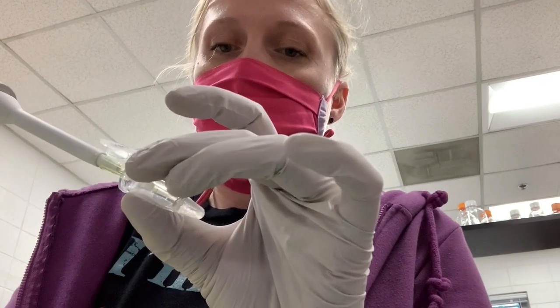So I'm going to add my T7. This is our RNA polymerase, and it will be in a tube that looks like this, or something similar. Remember, you're just going to take the enzyme off the block long enough to pipette it, and then you'll put it right back. I'm pipetting into the liquid, and it's a little bit viscous. It's in glycerol, so I will mix them well in a moment.